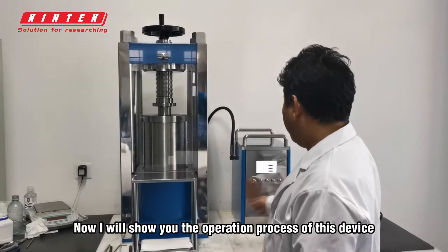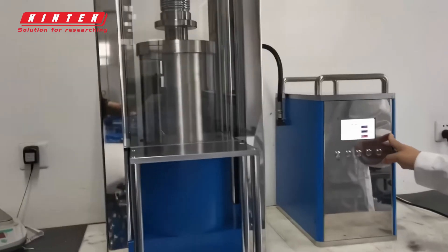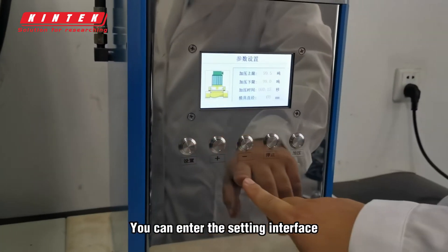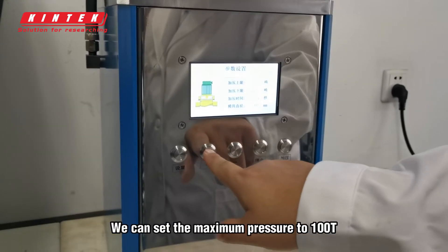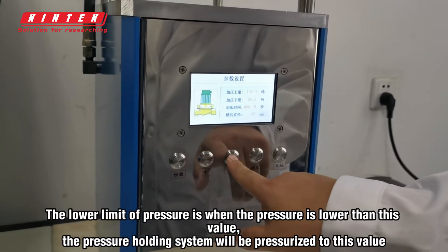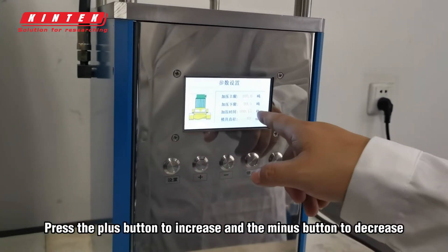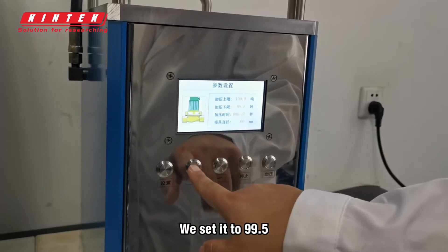Now I will show you the operation process of this device. Press the settings button to enter the setting interface. Press the plus button to increase the pressure. We can set the maximum pressure to 100T. The lower limit of pressure is when the pressure is lower than this value, the pressure holding system will be pressurized to this value. Press the plus button to increase and the minus button to decrease. We set it to 99.5.